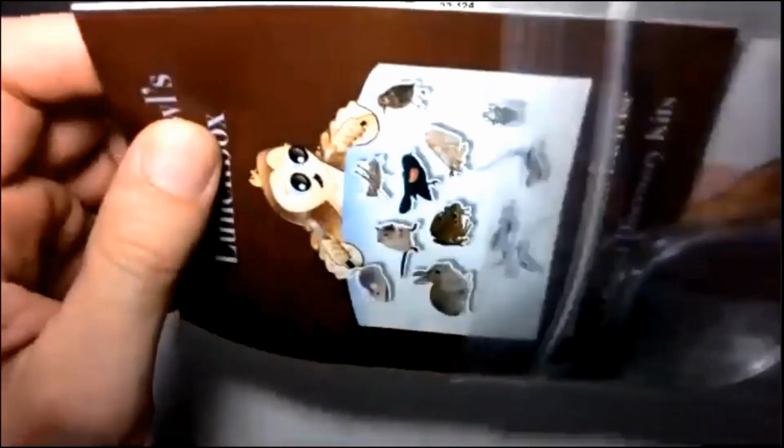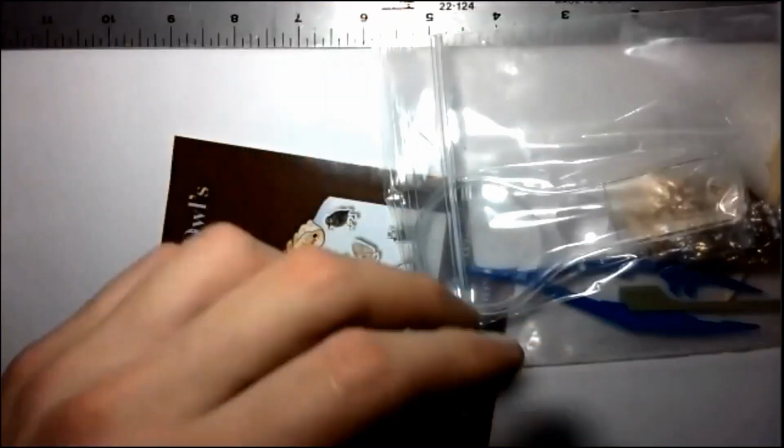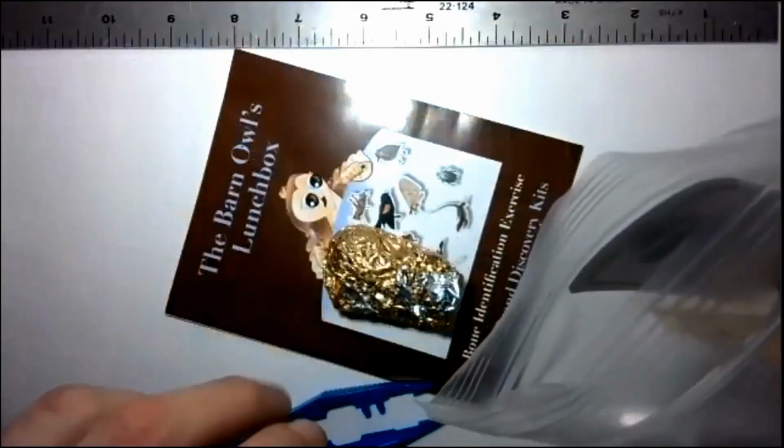And here we have one of the pellets from OVDK. They're nicely packed. It has a little brochure that shows where and how pellets are formed. We'll talk a little bit about that. And we're going to take one of the pellets and dissect it and see what we find.